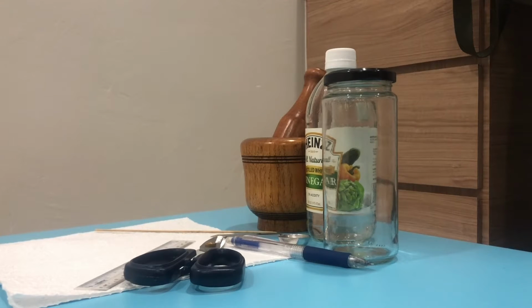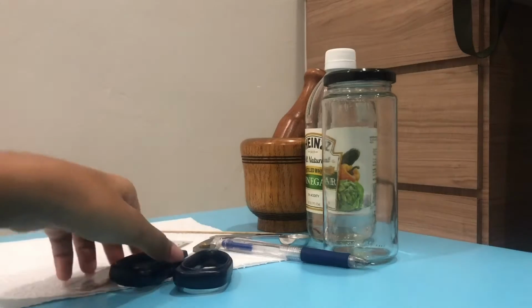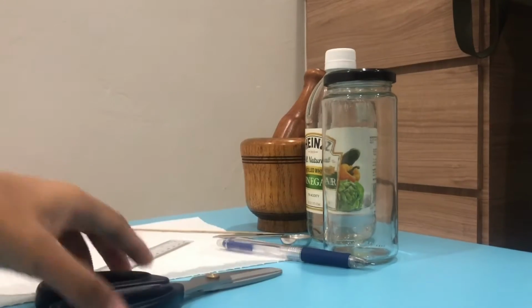My name is Denise and my matrix number is 23DVT 18F 2005, and the practical that I'll be carrying out today will be on the experiment thin layer chromatography. So these are the materials and apparatus that I'll be using.